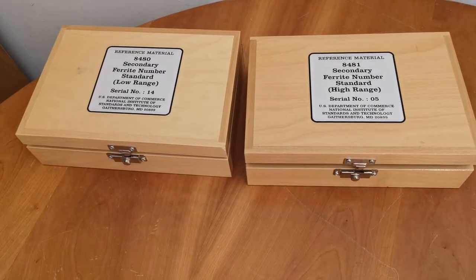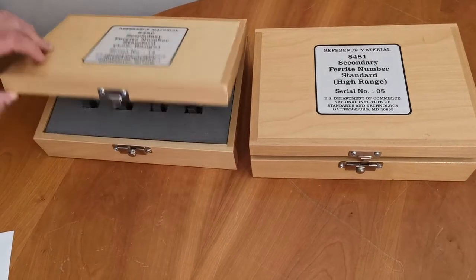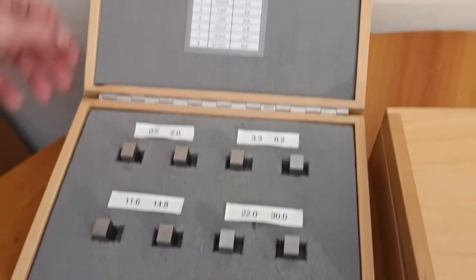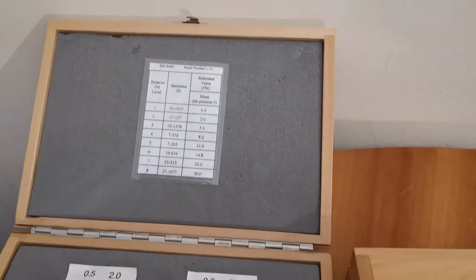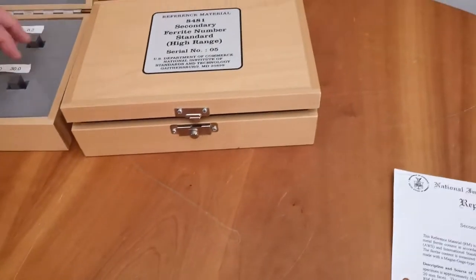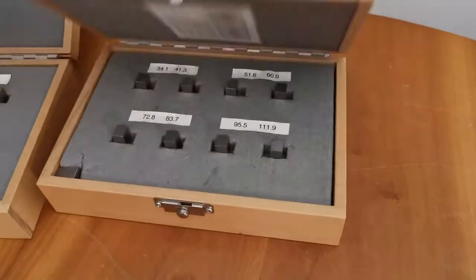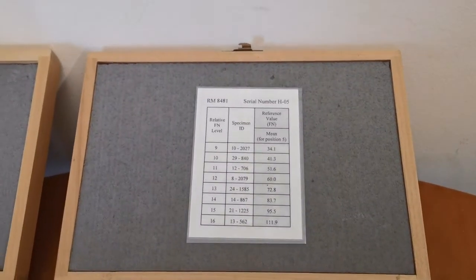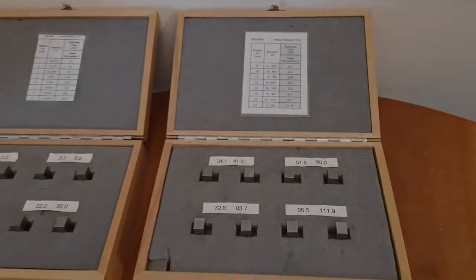The calibration uses the US National Institute NIST secondary ferrite number standards. Each probe calibration is stored separately in the meter. Because the Diverse Ferrite Meter measures over a reasonable area, the grain structure of the steel is averaged and this allows the instrument to be used without needing complex statistical analysis.